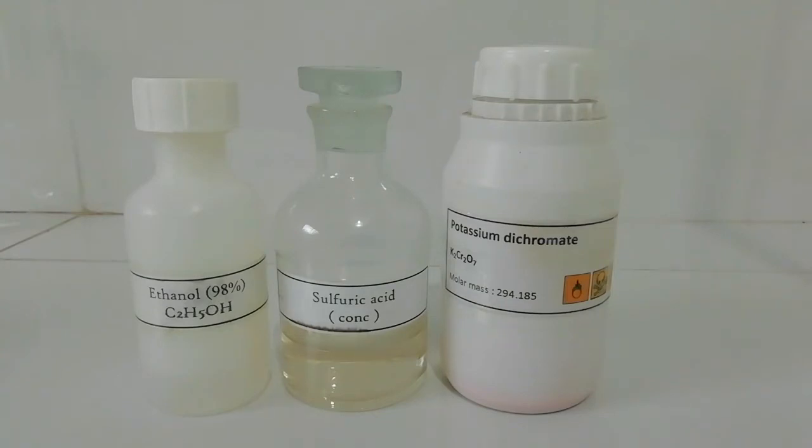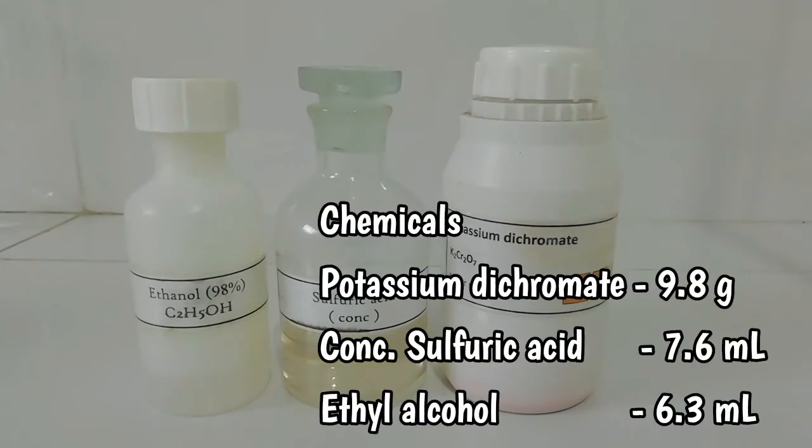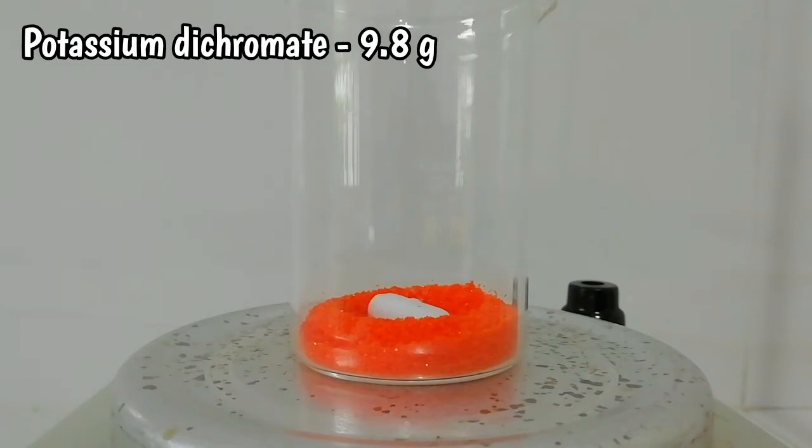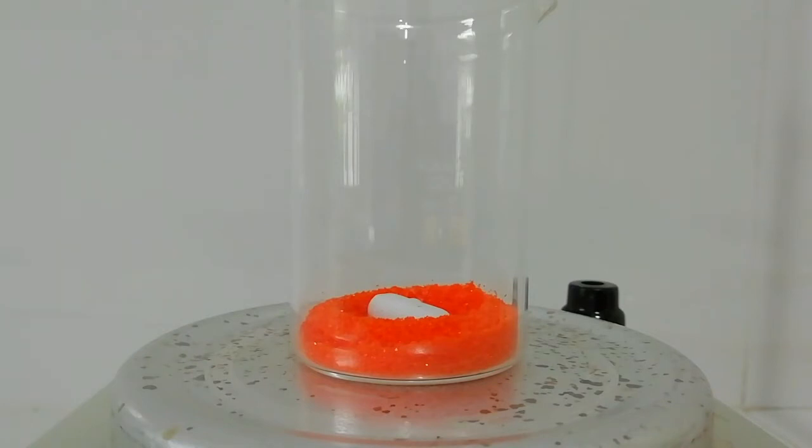To make this compound we need three chemicals: potassium dichromate, ethanol, and concentrated sulfuric acid. To start the reaction, I have taken 9.8 grams of potassium dichromate. Now we need to dissolve this potassium dichromate in 40 milliliters of water.